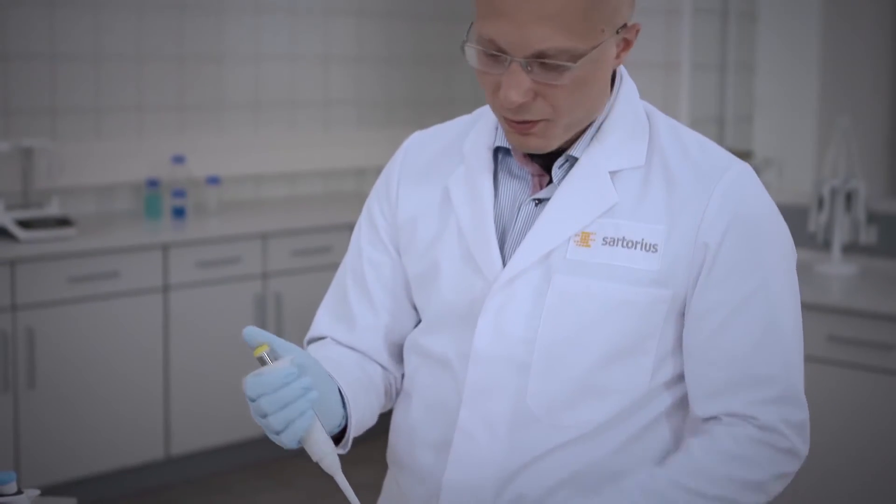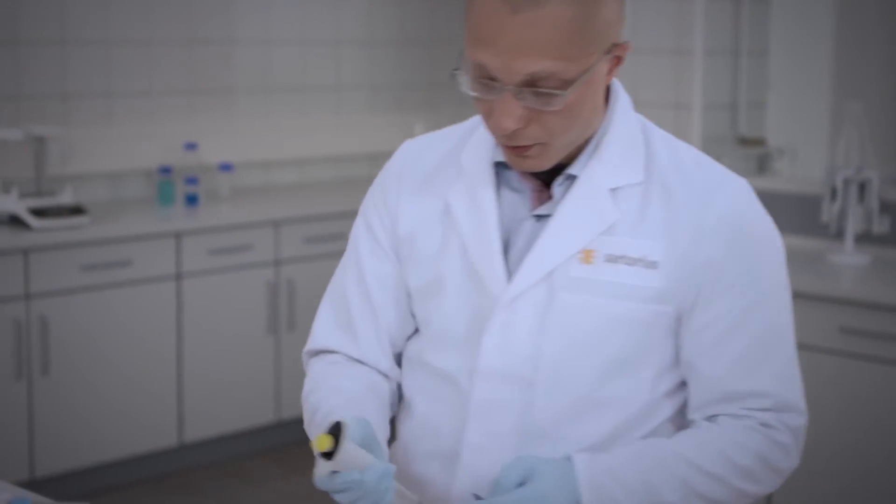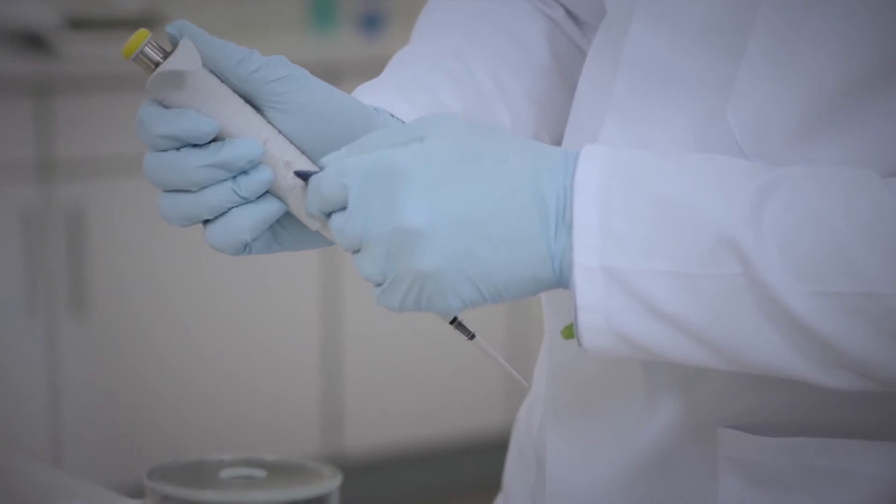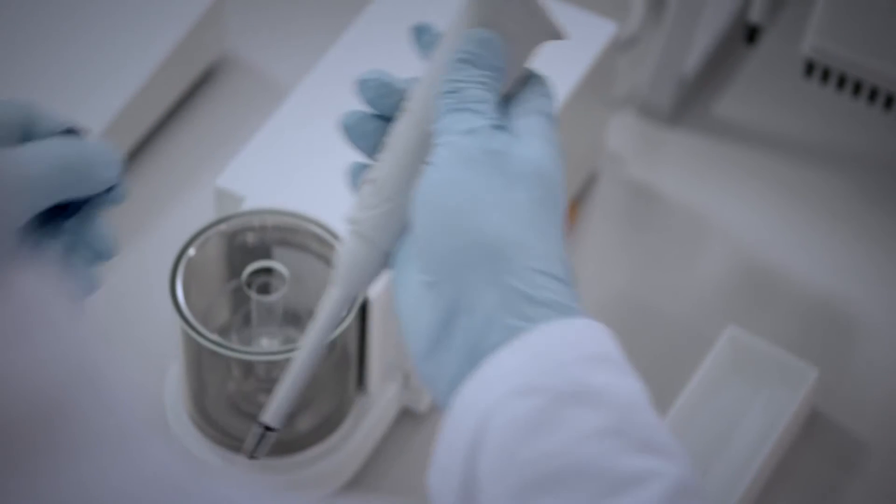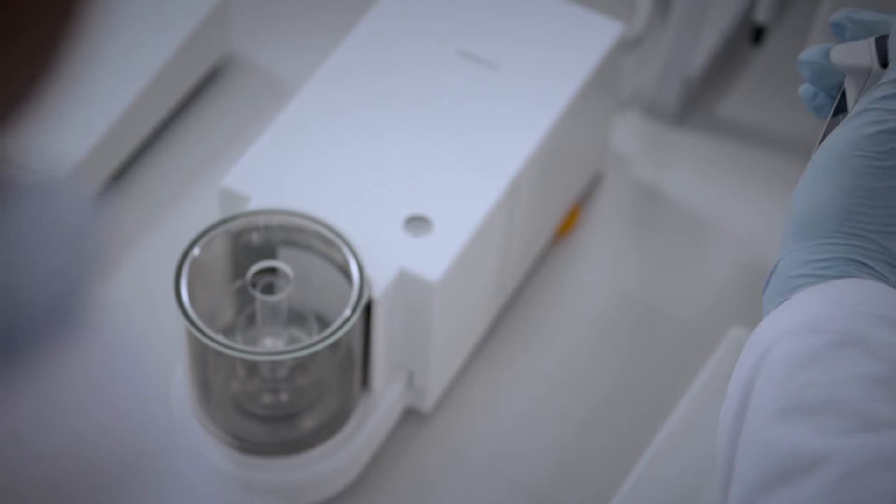Pipettes can often be adjusted to correct for accuracy using special calibration tools. A turn clockwise would increase the dispensed volume, while a turn counterclockwise decreases the volume.